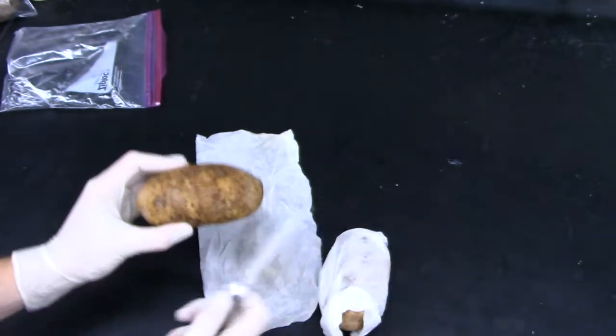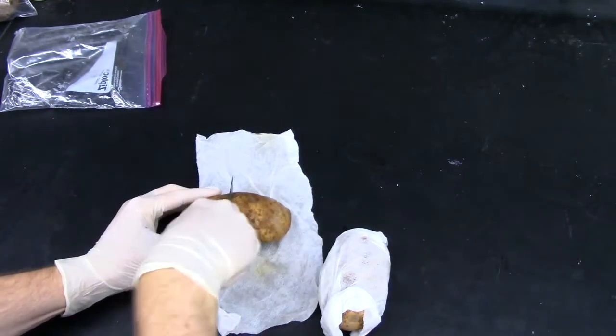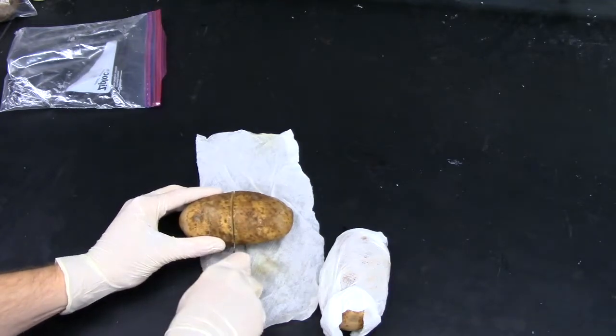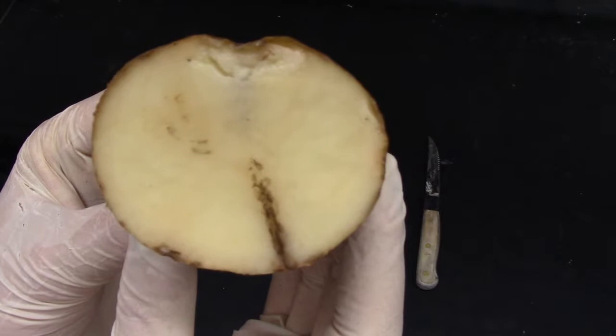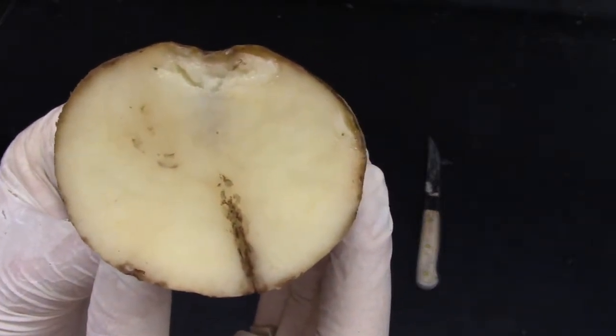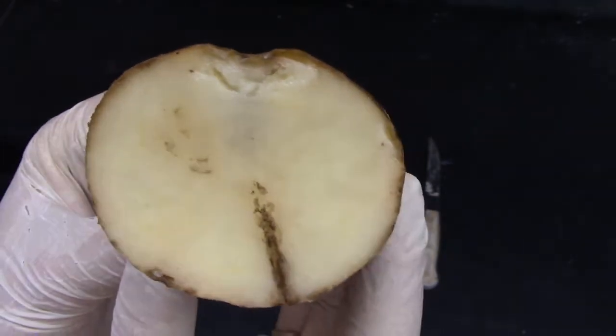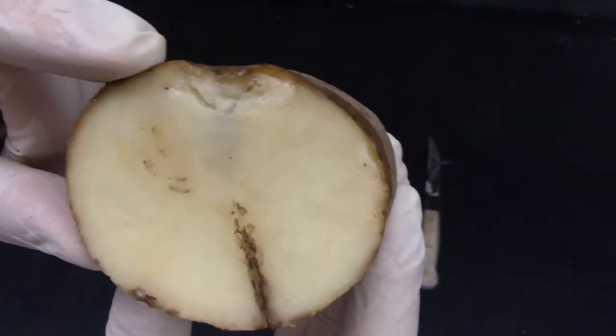So in order to observe this tissue, I'm going to bisect the lesion with this knife. So here we have a bisected potato, and this potato has 2 different important symptoms that the students will most likely see in this experiment. The first on top is a potato soft rot lesion.